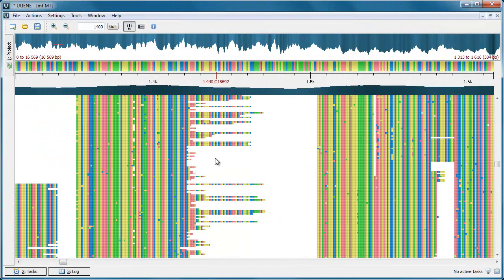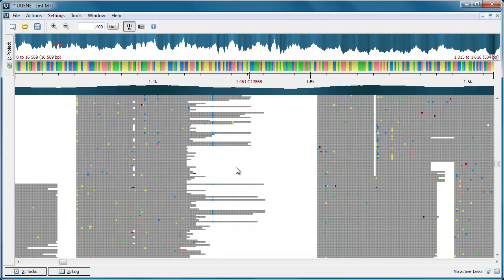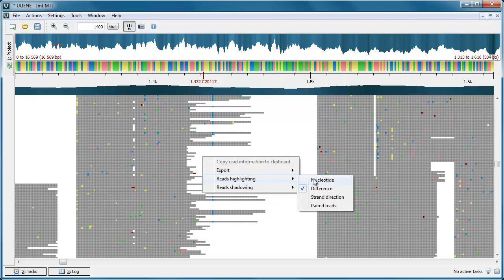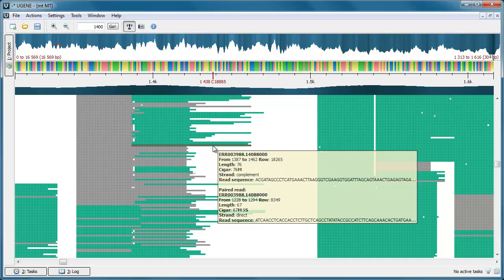The new modes of short reads visualization were added to the assembly browser. The Difference mode highlights only the bases that differ from the reference sequence. The Paired Reads mode highlights all paired reads in green. Note that the information about the mate is available in the hint.